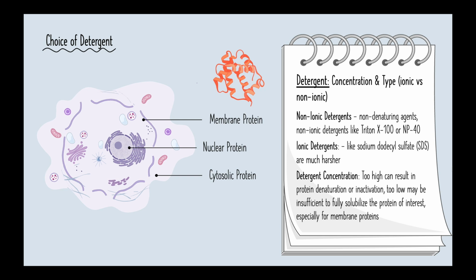I would say these are the most important aspects to consider when choosing the right lysis buffer. Always have a look at what's inside your lysis buffer, have a good understanding of the protein you are trying to purify, and always consider what is the downstream application and if any of the components may not be suitable for that application. I hope this breakdown helps you choose the right protein lysis buffer for your experiments.